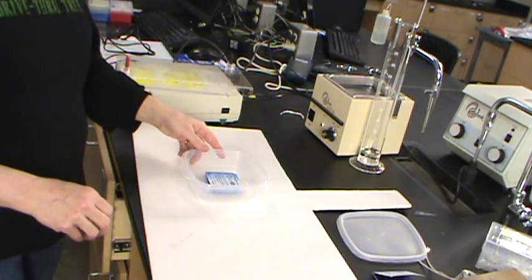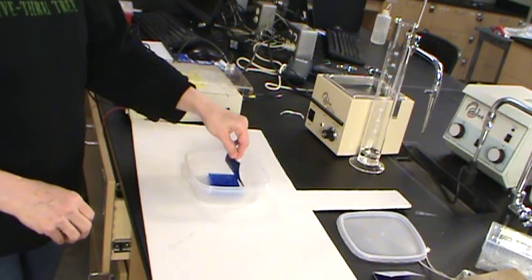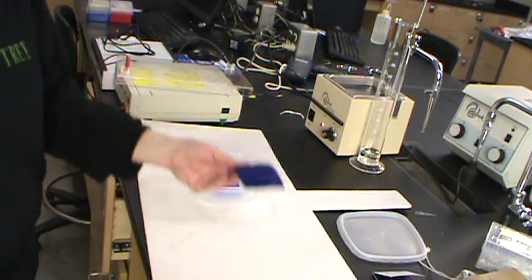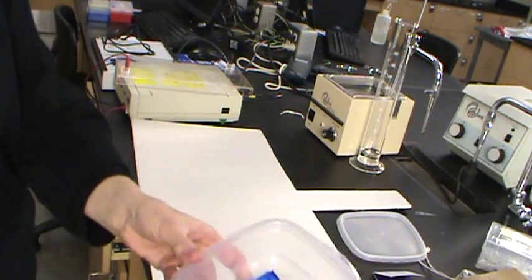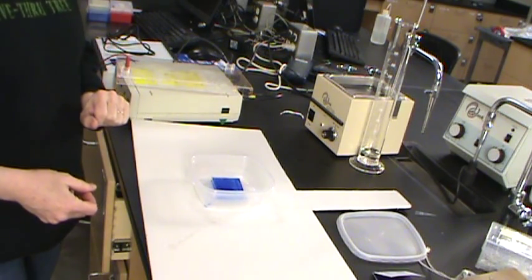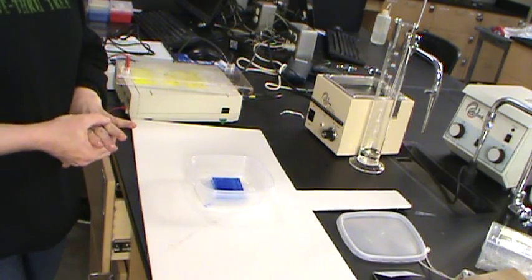And then after about 10-15 minutes, we're going to be able to peel that away, and you'll see that the whole gel is blue. But what we'll do is remove any of the excess dye by rinsing that with some warm distilled water. And then what should just be remaining are our DNA bands.